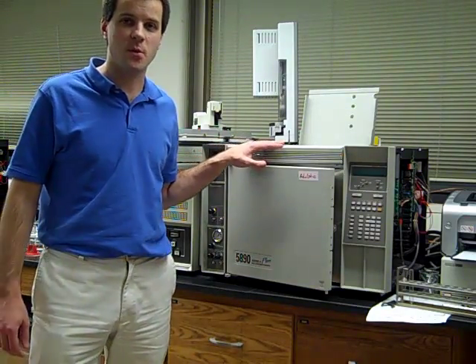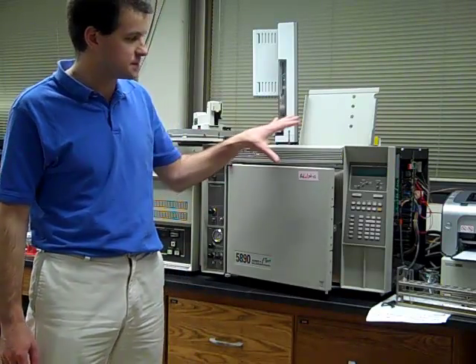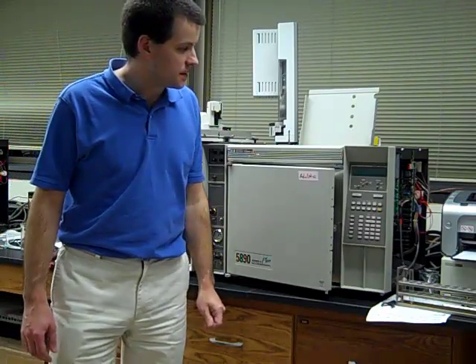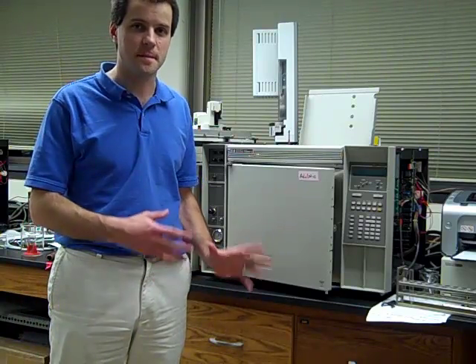This instrument here is what we refer to as a gas chromatograph, this piece of the instrument, coupled to a mass spectrometer. This particular instrument, like our other mass spectrometer coupled to the liquid chromatograph, is really built for measurements of the mass of molecules, as well as giving us information about how molecules are put together. Our other instrument, the liquid chromatograph coupled with the mass spectrometer, is really well suited to the analysis of highly polar compounds, that is, highly water-soluble compounds.